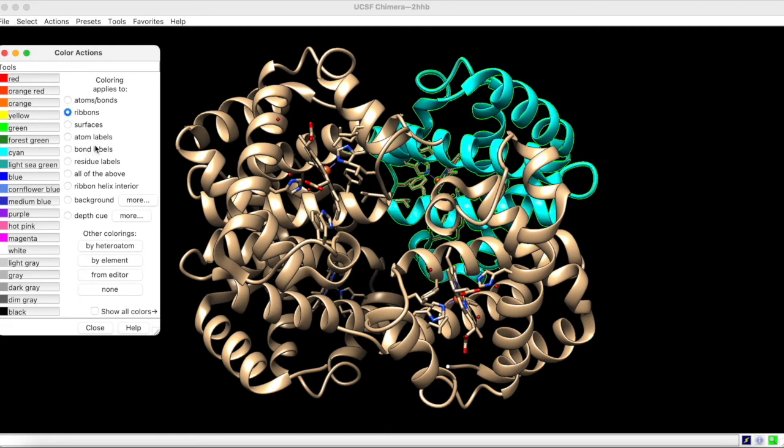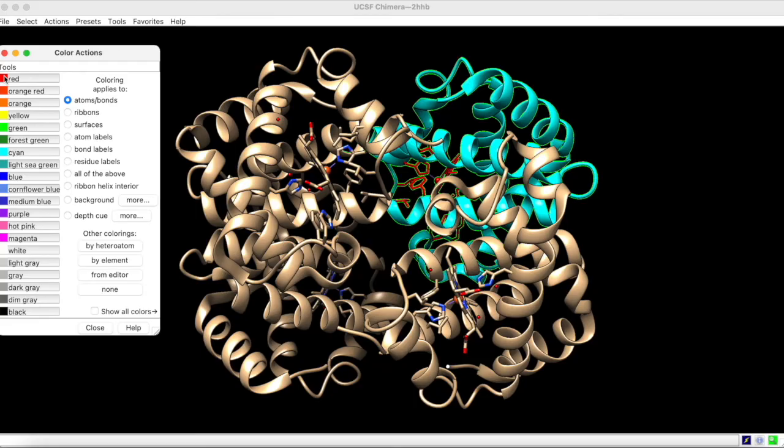Now, notice that the atoms and bonds have retained their original coloration, but if we want to color those as well, we can choose this option and the desired color.